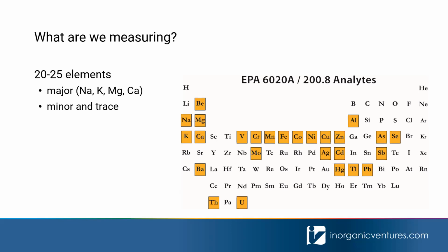And so I generally use that as kind of a cutoff when someone would bring me a sample, and I would look at the periodic table and say, what element do you want to measure? If you're above rubidium, molybdenum, things like that, I went, wow, okay, this should be relatively simple. When you're below mass 80, things get a little bit more complicated, and we'll examine that in more detail.